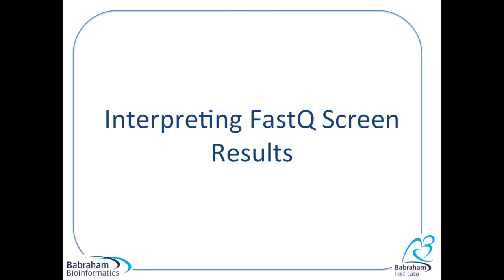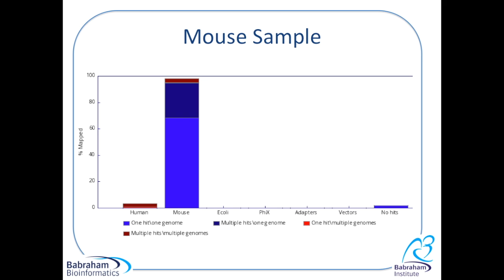In this video we're going to look at a small number of FastQScreen reports and try and interpret what they mean. The first sample we're going to look at is a mouse sample and we've screened the reads which have come off our sequencer against human, mouse, e.coli, phi x, adapter sequences and commonly used cloning vectors.